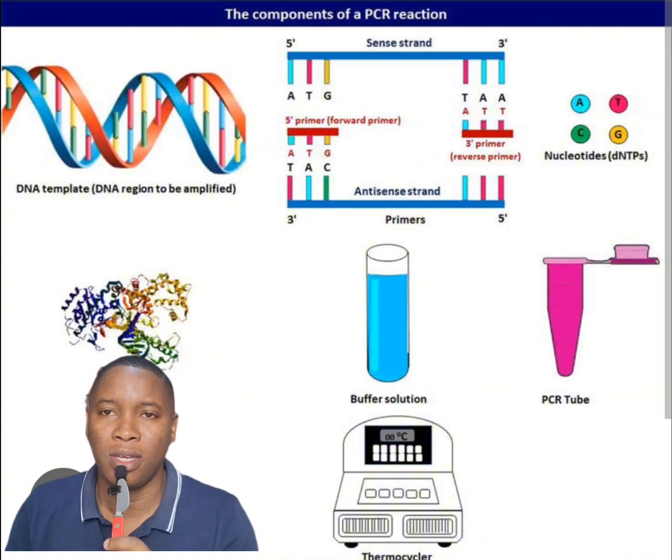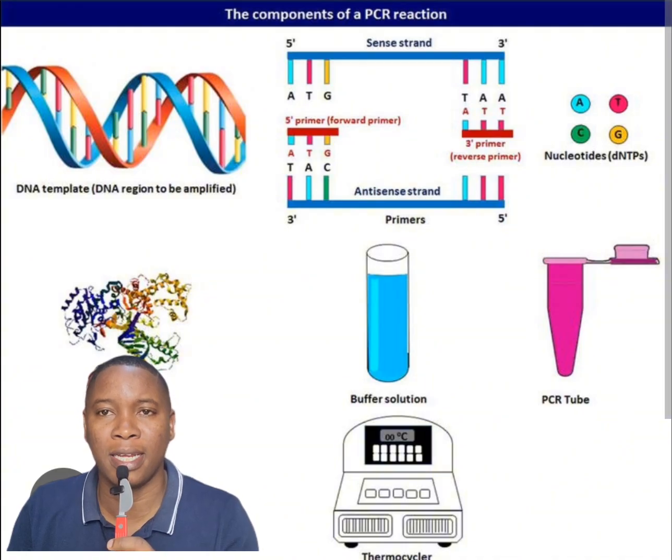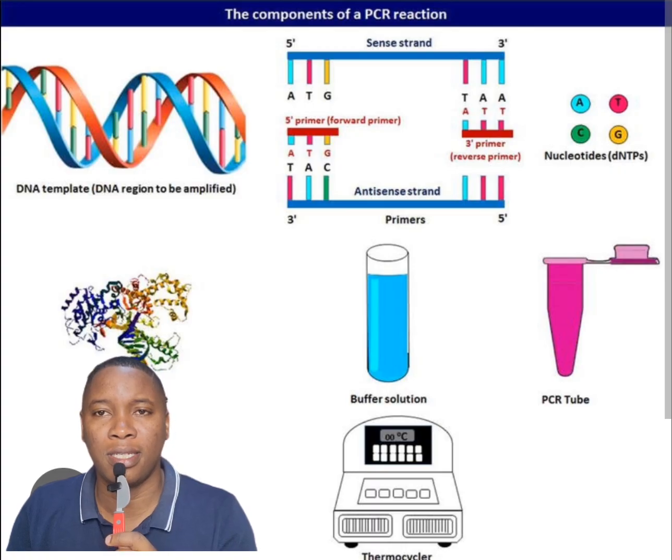As we continue gaining more understanding in the world of science and life sciences in particular, today we are talking about PCR. That's polymerase chain reaction, PCR. Now, this is a laboratory technique that is well used in the life sciences, and it is used for many purposes. But the underlying principle, the most important thing in conducting a PCR, is trying to take a sample and get a sequence of a DNA, and then amplify or multiply this sequence into thousands in such a way that this sequence now becomes more available, accessible, and can be studied, and is more important for use.